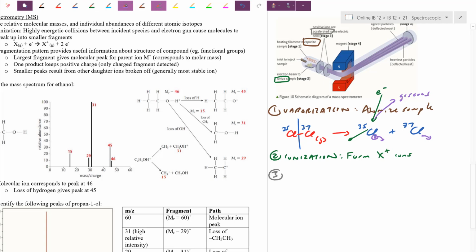We're actually going to set up an electric field. Now that we have suddenly all these positive charges, if I have one plate set as positive, the other plate a little bit negative voltage there, the positive ions will actually have an acceleration that will actually be sped in this direction.